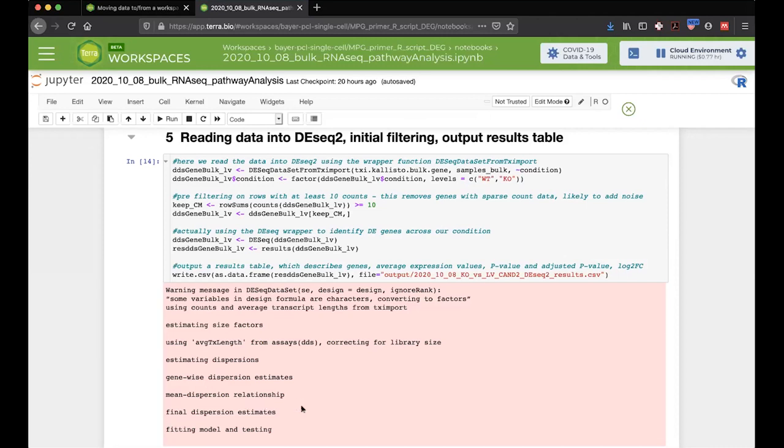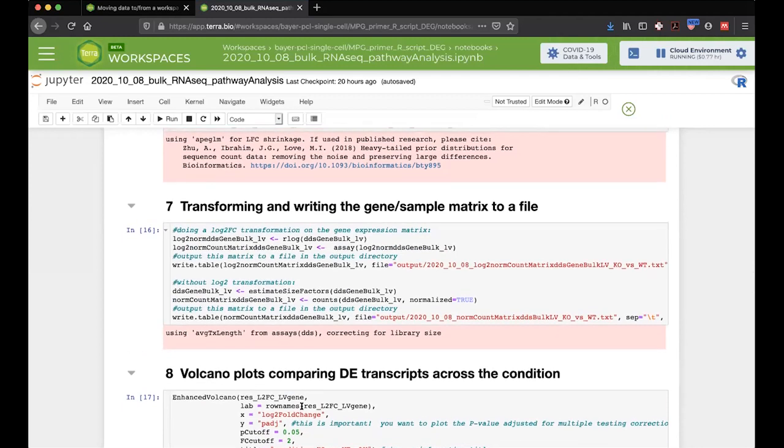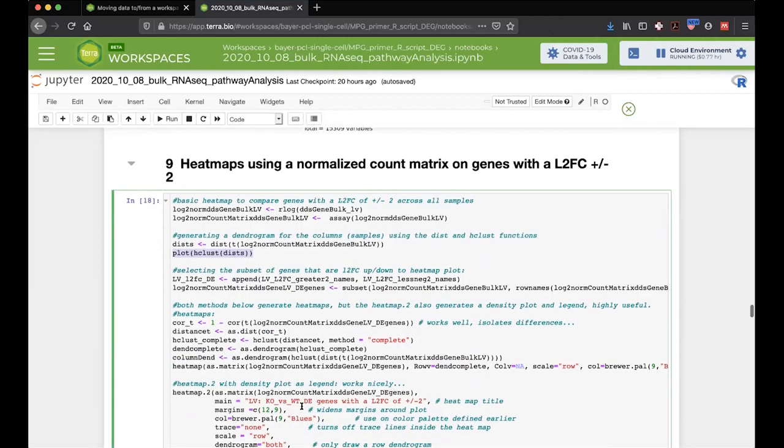And I don't have the details about that specifically in my head, but Michael Love, who wrote DESeq2, has written quite a lot about how to think about that. And I think Salmon also does that as well. But that was one of the reasons I went with DESeq2 as opposed to edgeR, because I thought DESeq2 implemented that in a way that at least I found easier to understand. But I don't have a way more detailed description right now, other than that for very long genes and very short genes, you want to have a good model to compare them.